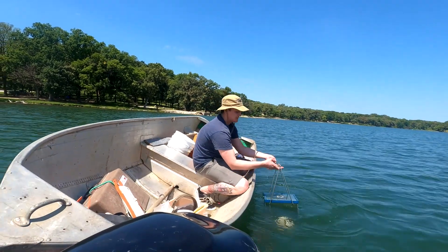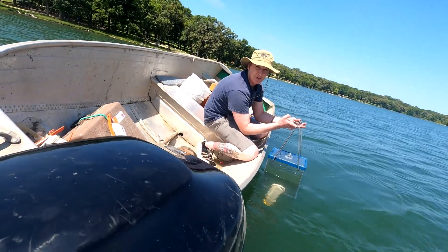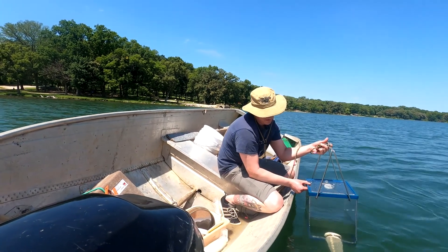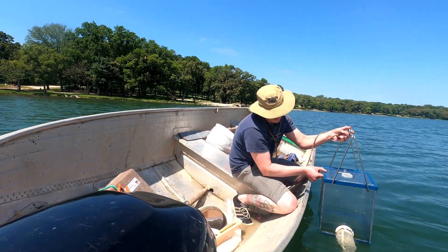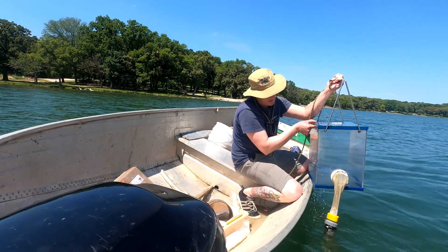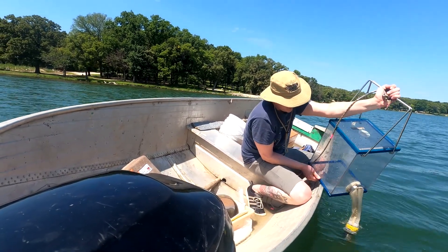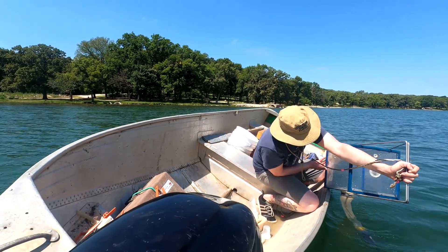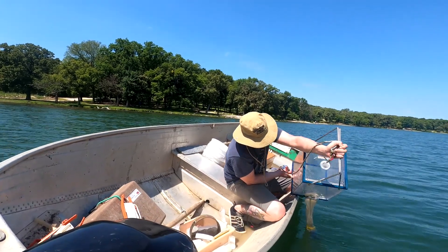Now that it's up top, I'll pull it slowly up. We have time for the water to drain through. You can actually hear the air hissing in there. Now I'll put it up on the edge of the boat and drain all that water. By draining all the water down, it allows us to take a quantitative sample. This is our plankton.